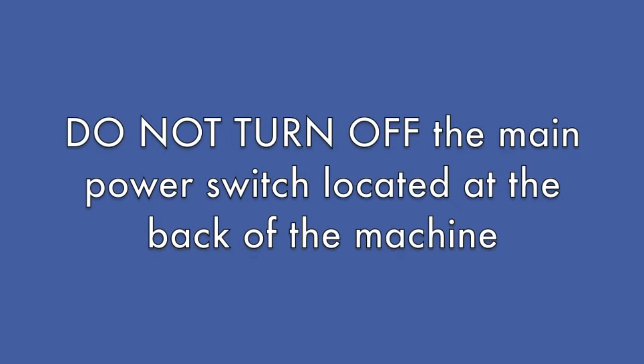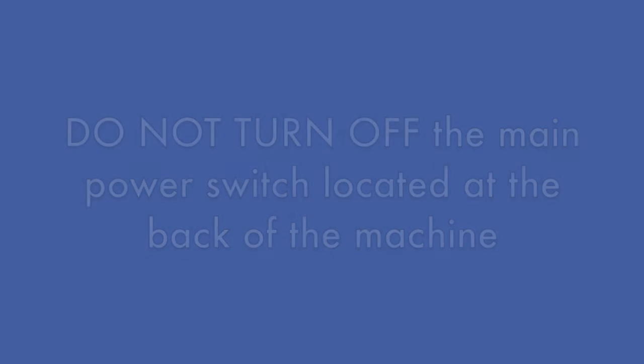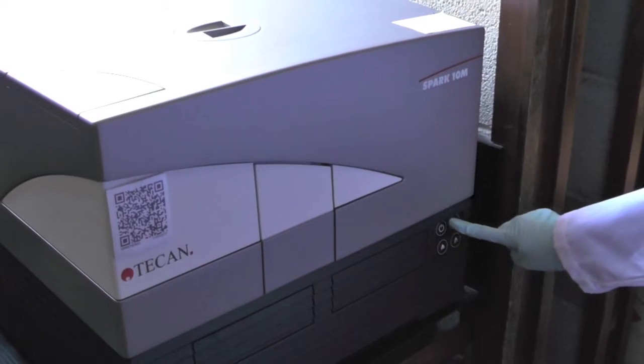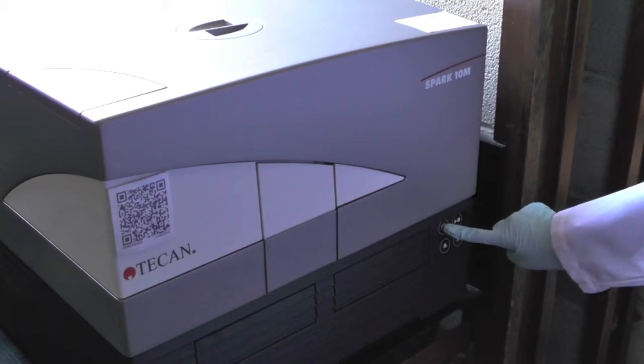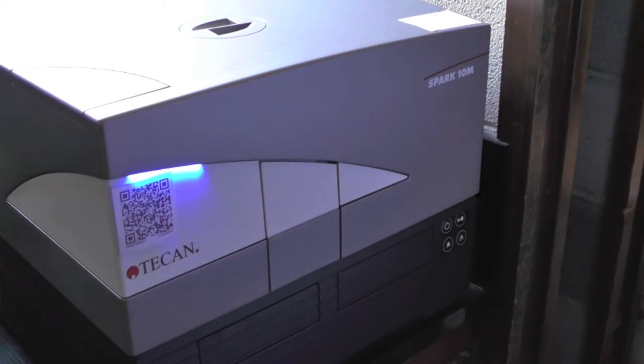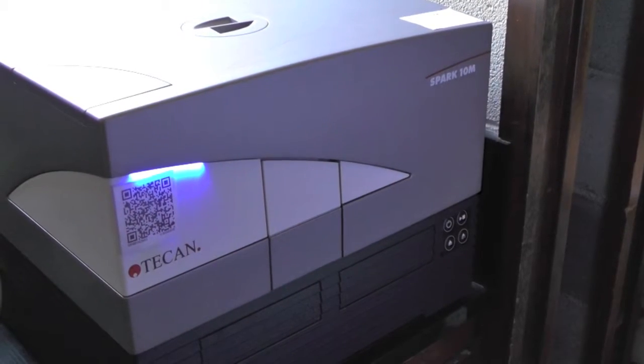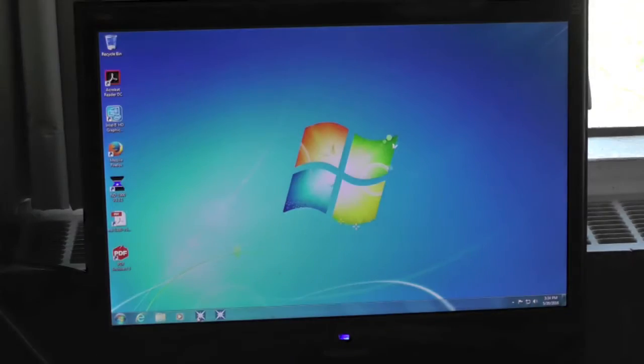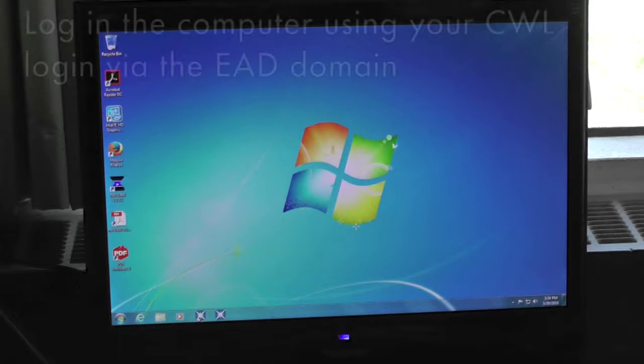First, the main power switch of the spectrophotometer is located at the left rear end of the instrument. The main power is usually left on except for power shutdown or long holidays. Turn on the T-CAN spectrophotometer by pressing the power button in the front panel. Turn on the computer as the spectrophotometer is controlled by the software SparkControl.